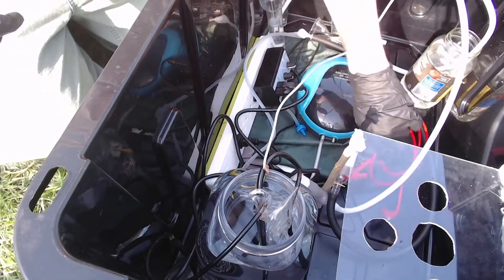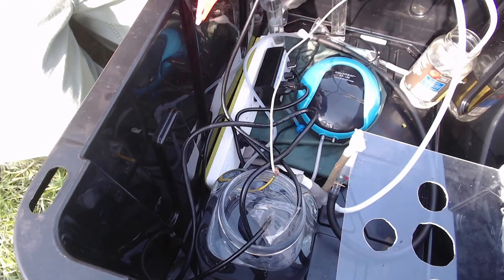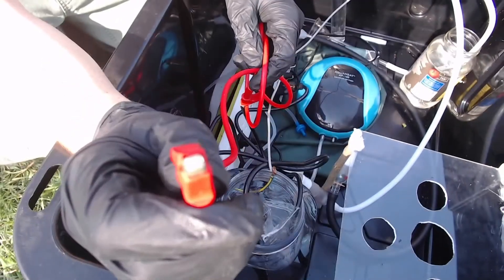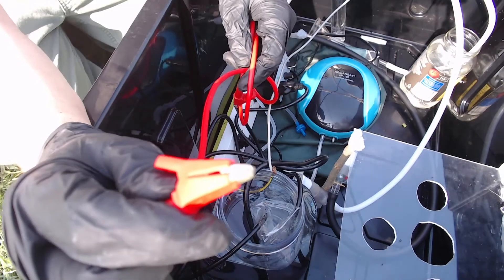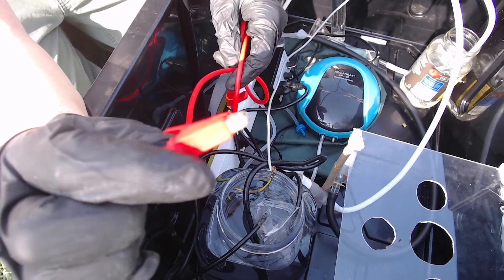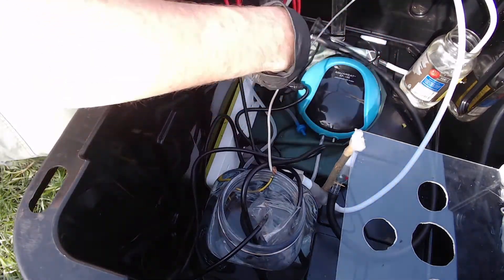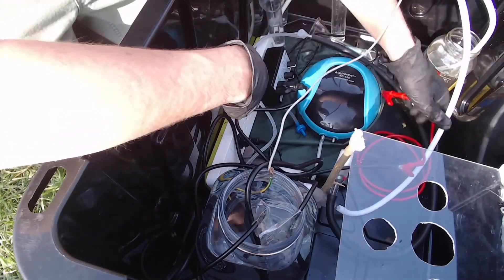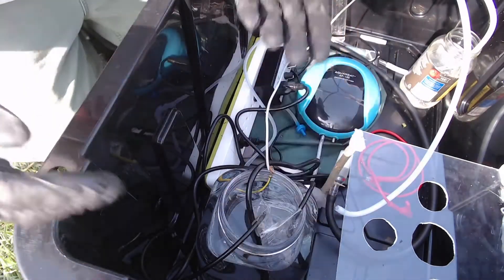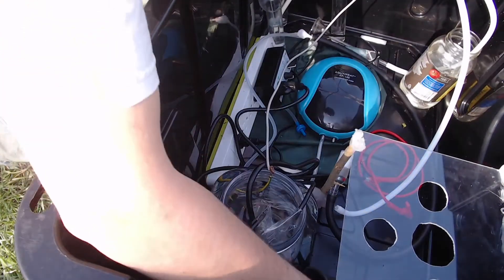Coming off the transformer we've got the two alligator clips. They were nice and shiny when I got them, but when I was first running this the scrubbing setup wasn't the greatest, and after just a few days in here, some of the alligator clips have already corroded somewhat significantly. Same thing on the other side — the other alligator clip is just tucked up in here out of the way.